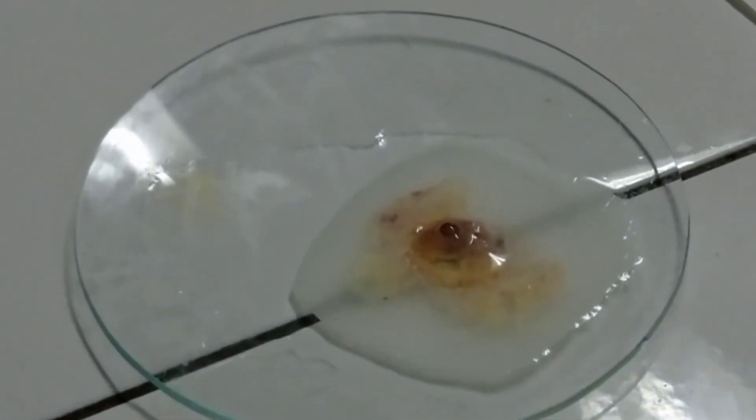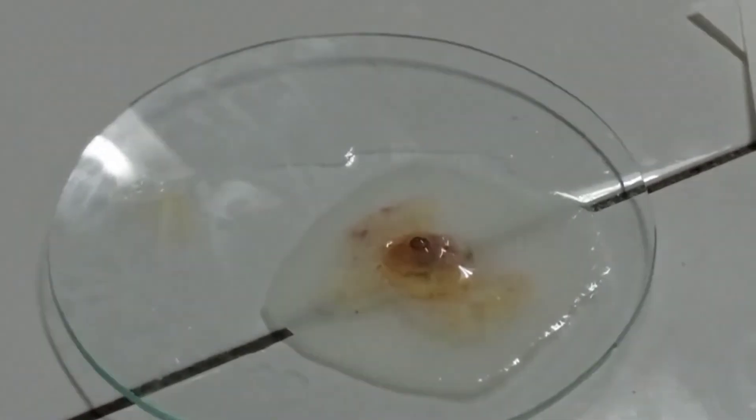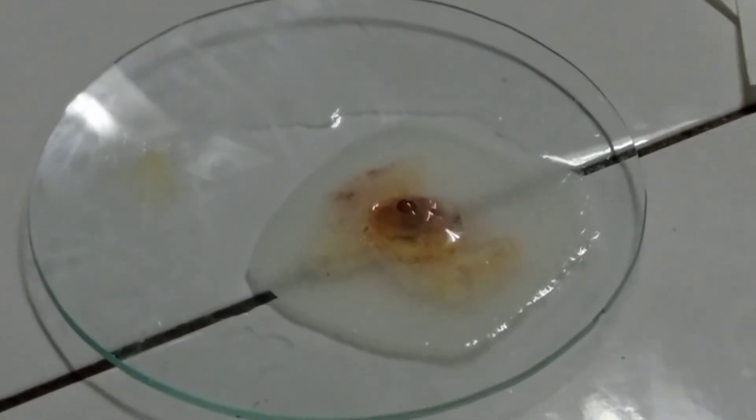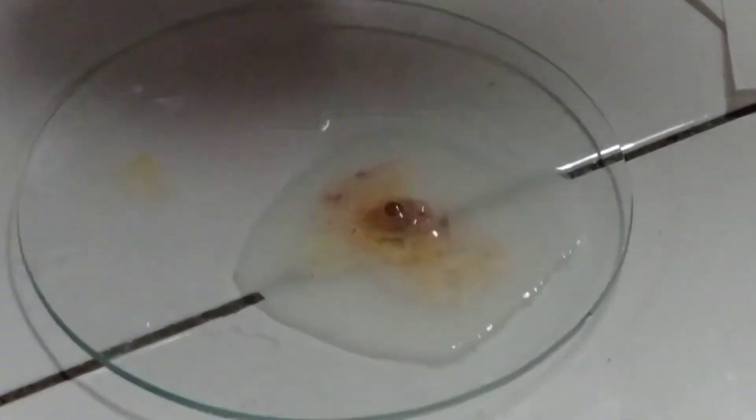Langkah terakhir, yaitu pemberian larutan formalin yang bertujuan untuk fiksasi, yang mana untuk mematikan sel-sel dalam jaringan tanpa merusak bentuk dan strukturnya, lalu melindungi dari kehancuran atau kerusakan karena embryo akan diawetkan.